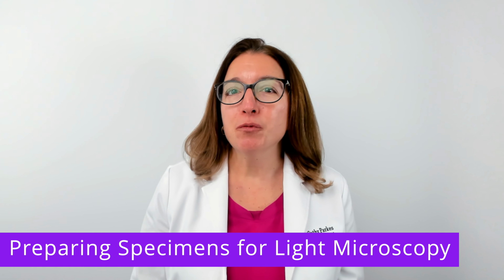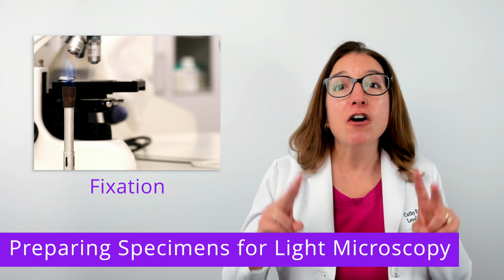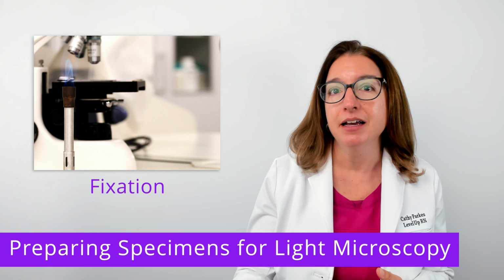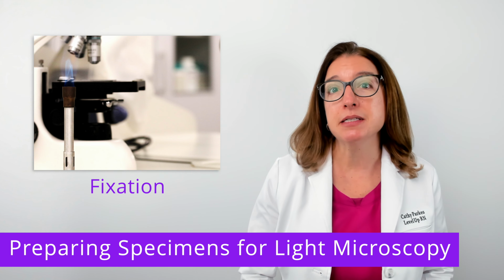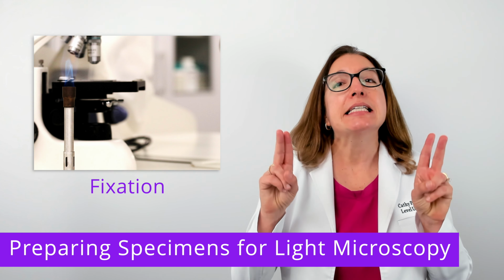The other method for preparing a specimen is fixation, which is the process of fixing or attaching the cells to a slide using heat or chemicals. Of note, fixation does kill the microorganisms in the specimen. So first, we need to create a smear.